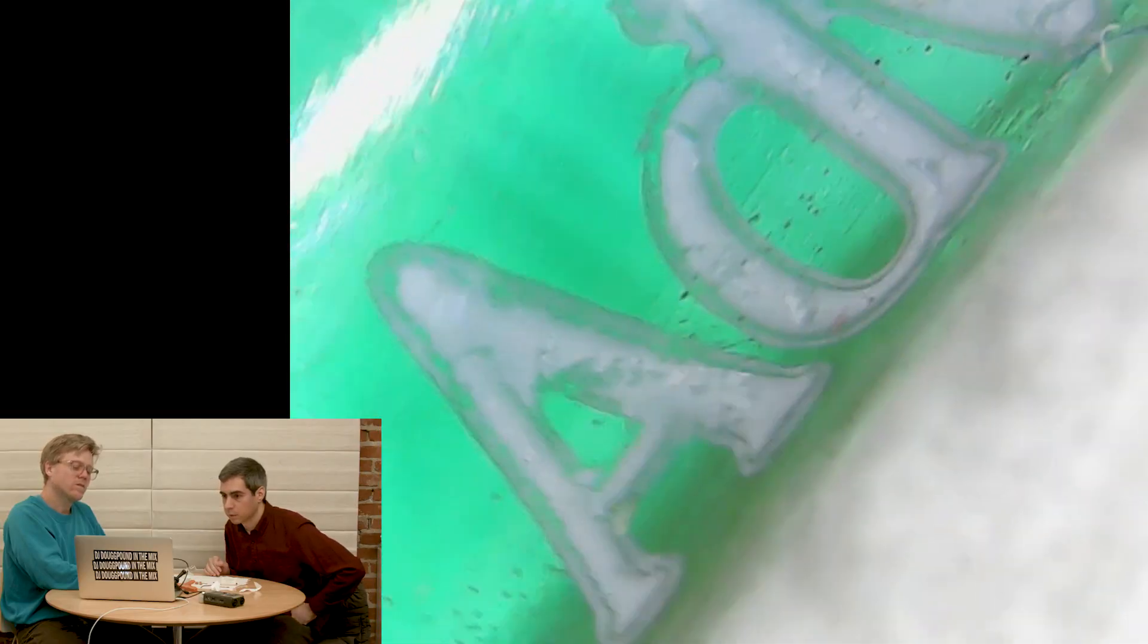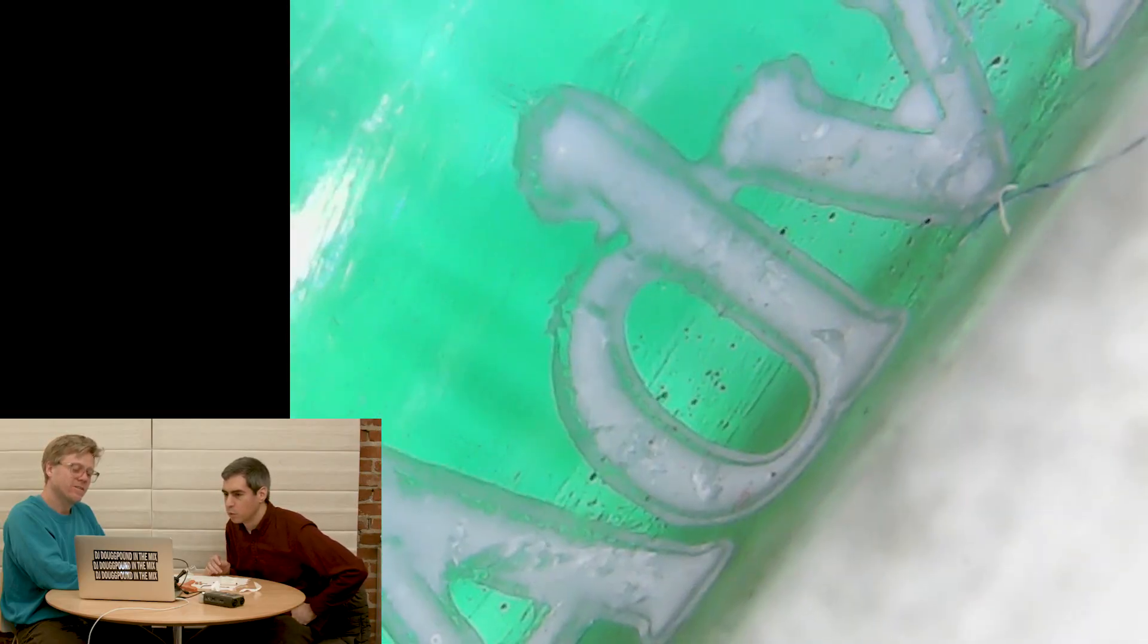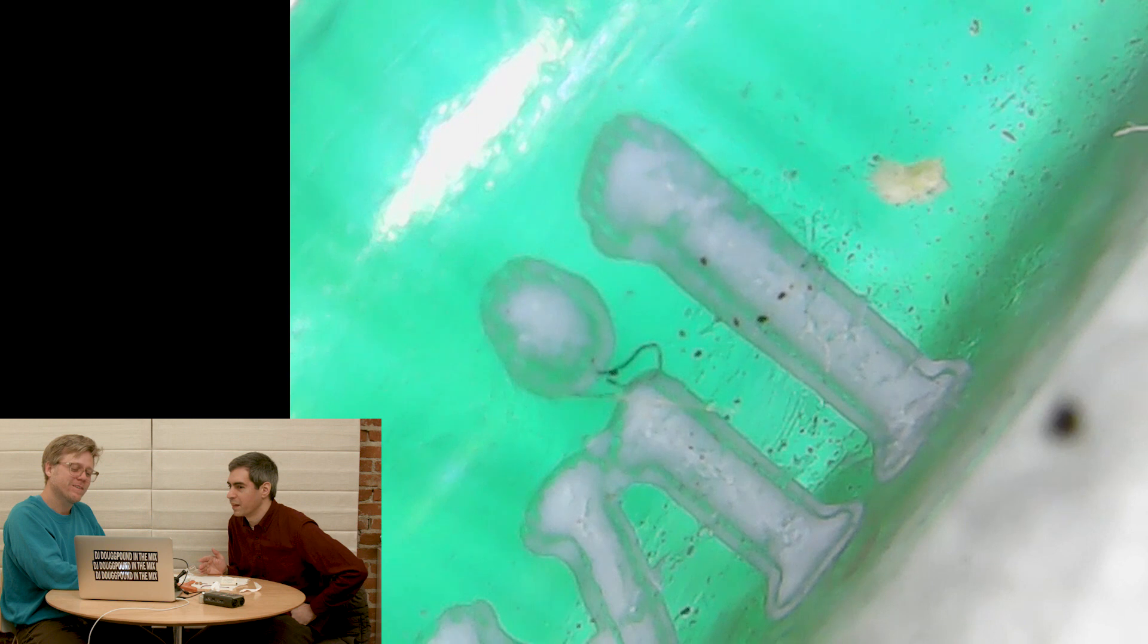Let's just see what it looks like here on the microscope show. Oh, there's Advil. Oh, look at that. They print it right on the gel. So you eat the print. What is the print made out of?